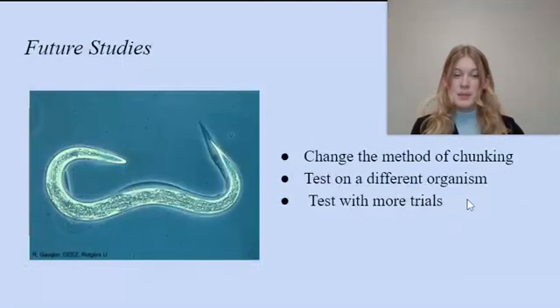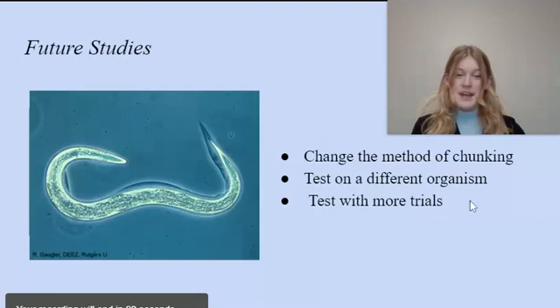The original idea of placing the chunk in the middle of the plate and recording observations on how fast and how far the worms have traveled in a period of time, using concentric circles moving away from the original chunk, was a good idea. But there is no way for the chunk placed on the plate to stay in its original spot, and due to that, after a few days of observing the plates, it was noticed that the chunks had slid. In the future, if there is a solution to this problem, the data collected for region spread 2 would be more accurate.